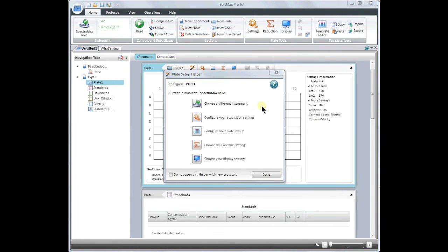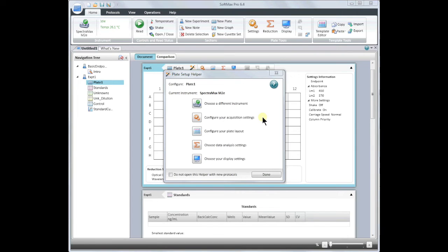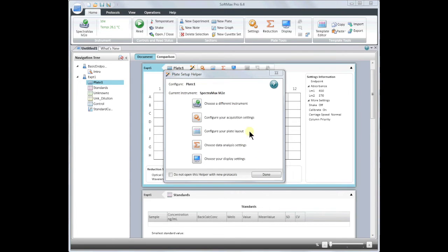At this point, you may read your plate. After you read your plate, you may not choose a different instrument and you cannot change your acquisition settings. However, you can make changes to your plate layout, analysis settings, and display settings after you read your plate. Or you could continue on and set all of this up before you read your plate.